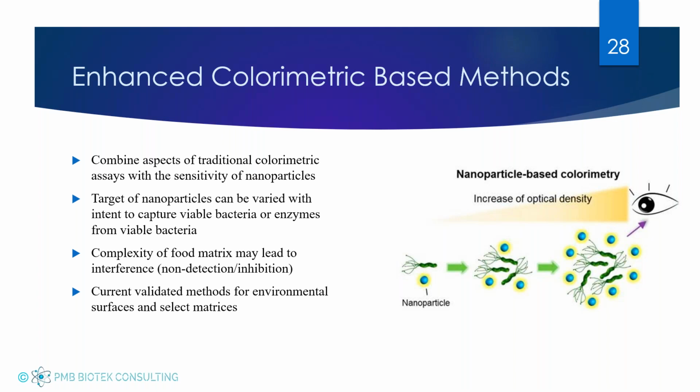So you don't have to worry about inhibited samples because they're binding to the organisms. There's not those PCR inhibitors that cause issues with your fluorescence. They don't cause issues when we're looking at some of these colorimetric methods that they've designed these so that they move beyond them.